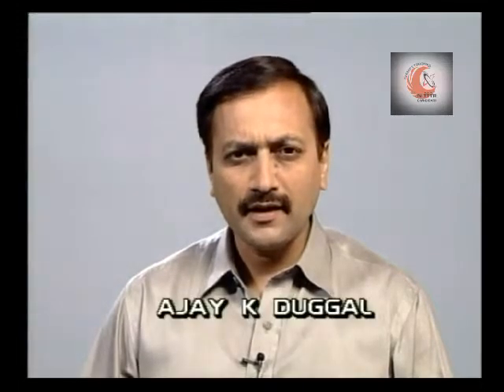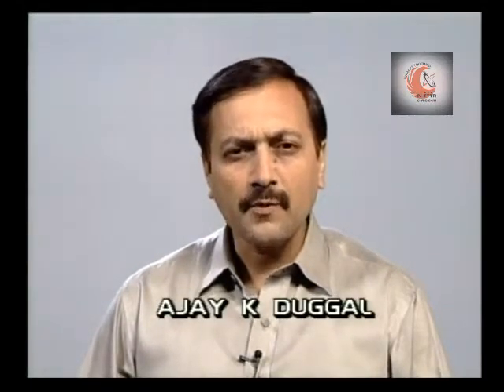Hello viewers, and welcome once again to this series on laboratory measurement in public health engineering. In our previous programs, we had seen how we measure various properties of water in the laboratory. Now, in all such cases, we need to take the water sample to the laboratory and, using an appropriate instrument like a pH meter, conductivity meter, DO meter, etc., we measure the concerned parameters.